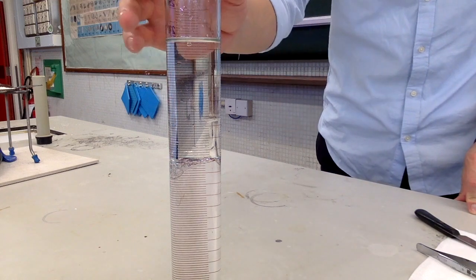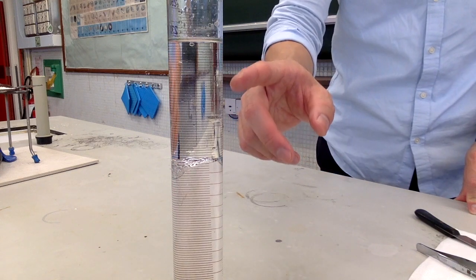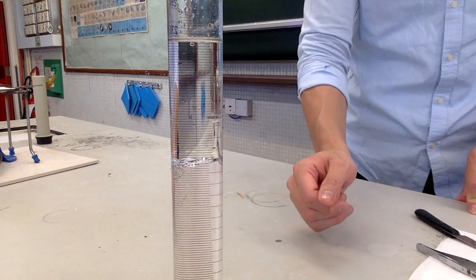Now, as you can see, there are two immiscible layers of liquid. Of course, the upper layer is the paraffin oil and the lower layer is the tap water together with a few drops of phenolphthalein.